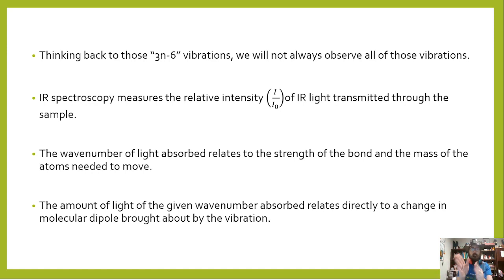Or, for example, if instead of being linear, it were to scissor, so it looks like a pair of scissors cutting in, in that case, the dipole would move down with the oxygens. Once again, we would see a vibration there, but we would not see the vibration that would be this symmetric stretch, where both oxygens move in opposite directions from each other.